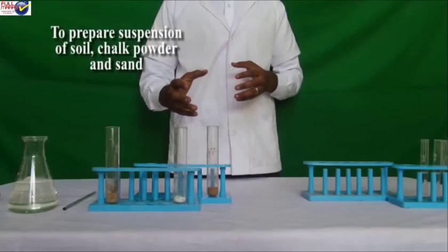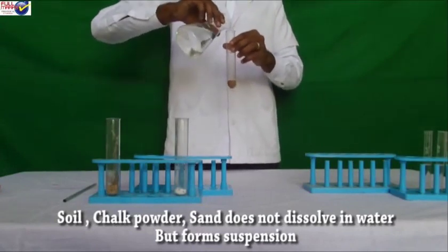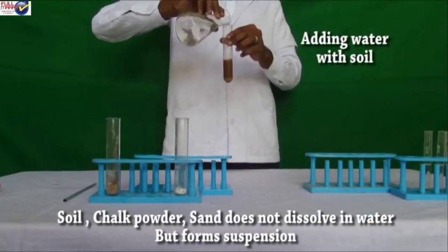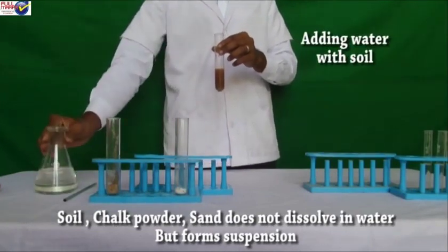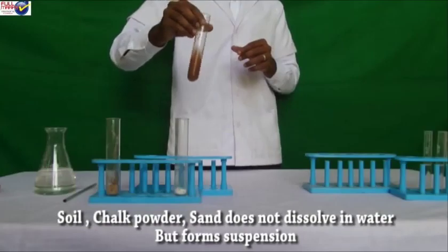B. To prepare a suspension of soil, chalk powder and sand in water. Suspension of soil in water. Take 2 to 5 ml of distilled water. Add half a pinch of garden soil. Stir well. Keep the test tube on the stand. Record your observation.